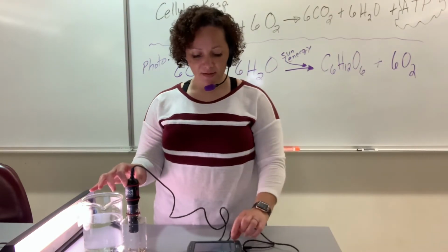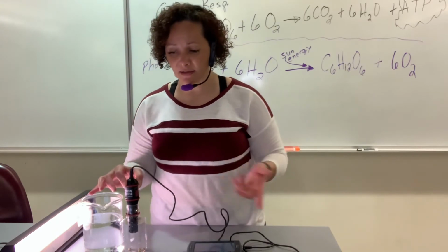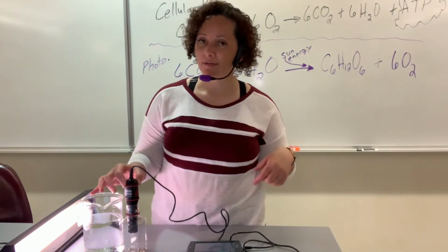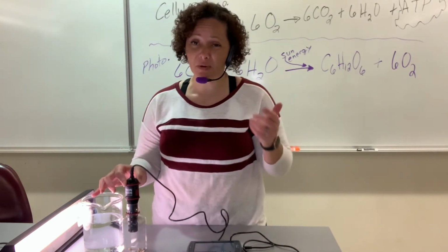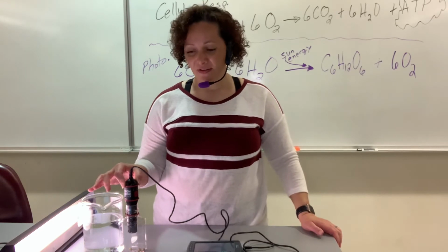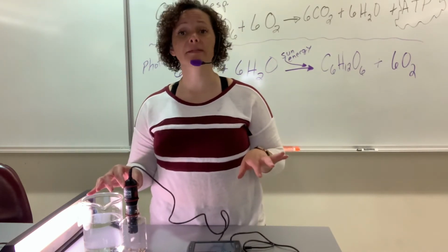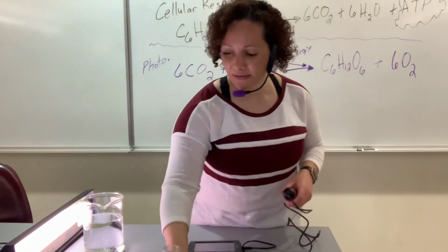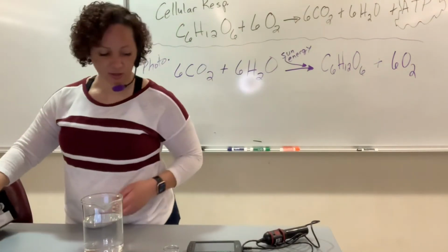Okay? Then once you get that data, you're going to write it on the next line, plant in the light. I said, remember, go in my order, but it doesn't matter what order. I say do the dark first, then the light. That's just how I work. Alrighty. So then you do this 3 different times, the exact same way I explained before. Take the average. All right, friends. I'm going to go ahead and get rid of this light.